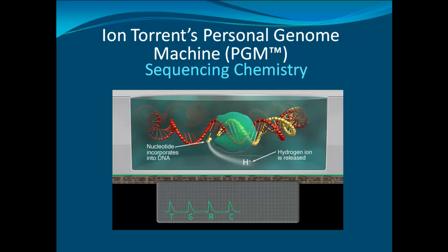Ion Torrent's personal genome machine works by calculating changes in pH to detect when a nucleotide is incorporated. One nucleotide at a time is flooded into the chip. Upon incorporation of a nucleotide, as in nature, a hydrogen ion is released. The resultant pH change is detected by a proprietary ion sensor. Due to this approach in sequencing, the Ion PGM has a unique error profile related to homopolymers rather than substitutions.